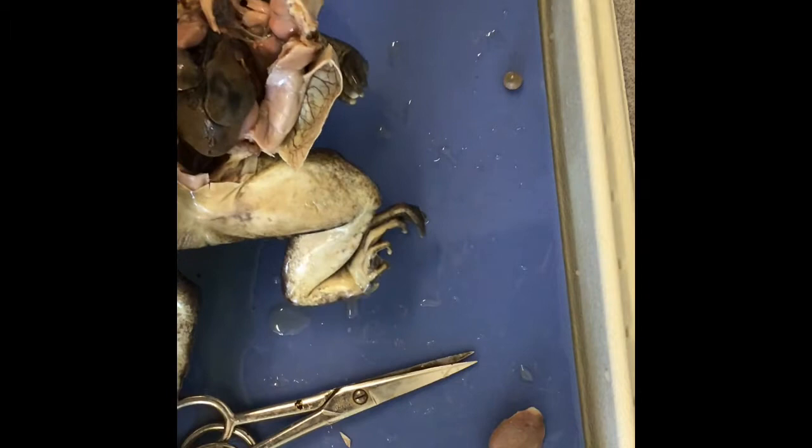On either side you should have the lungs, and these are going to be kind of black and spongy. There's one lung, and on the other side there should be a second lung back here, kind of hidden away right there.